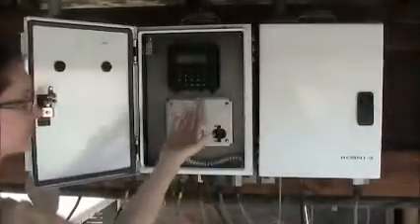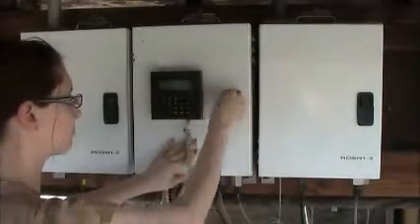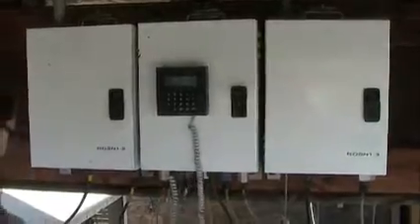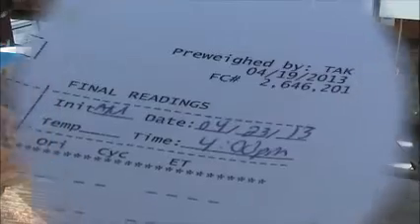Open the controller door to view the keypad. The keypad is attached to a cord for your convenience. Print your initials, the date, and the time in the final reading section of the log sheet.